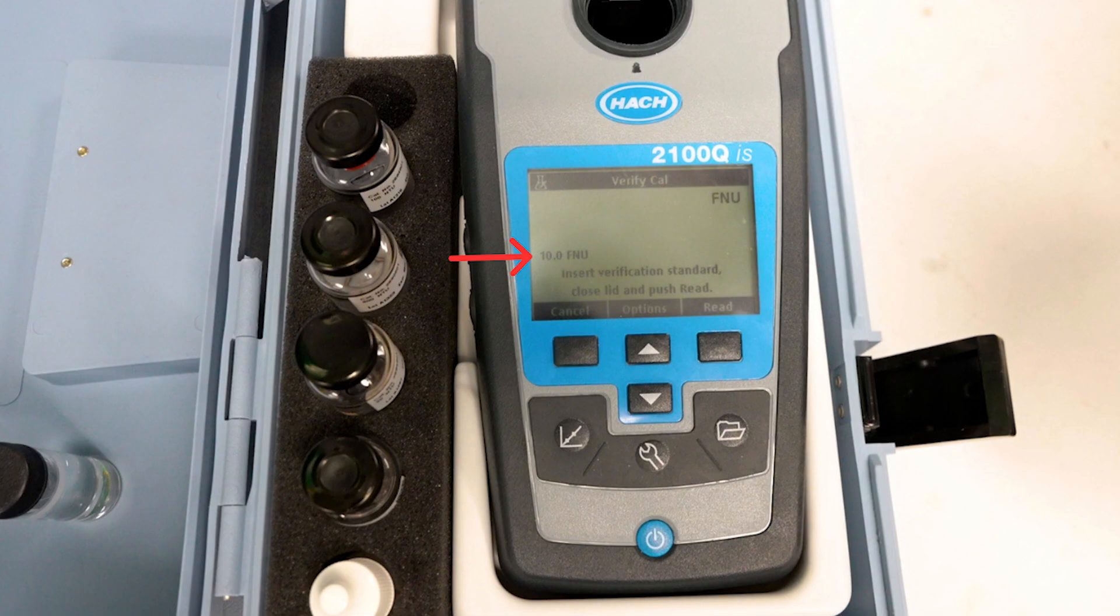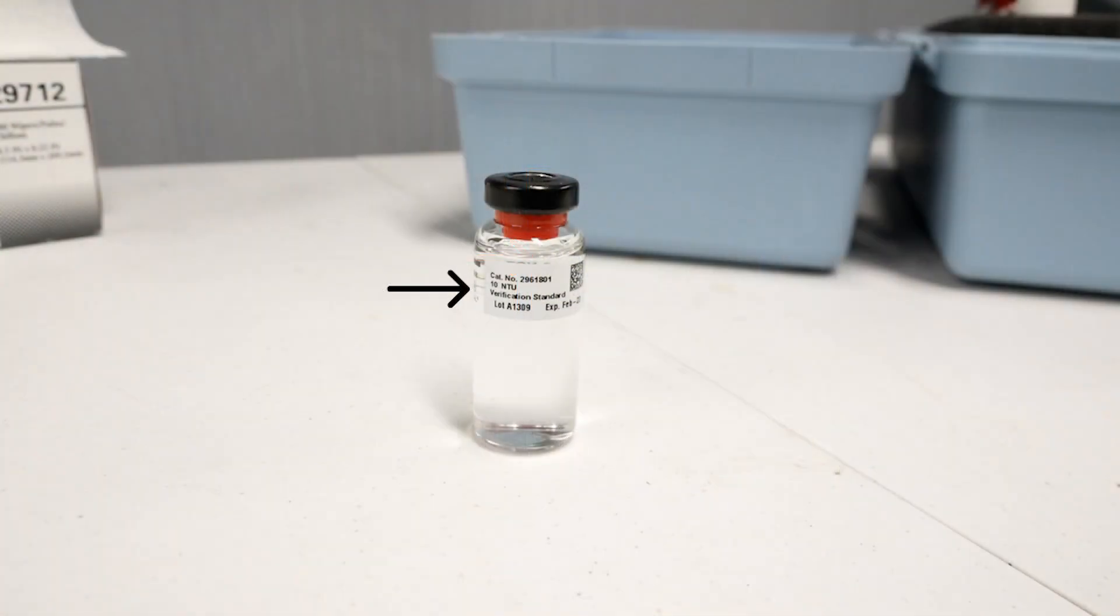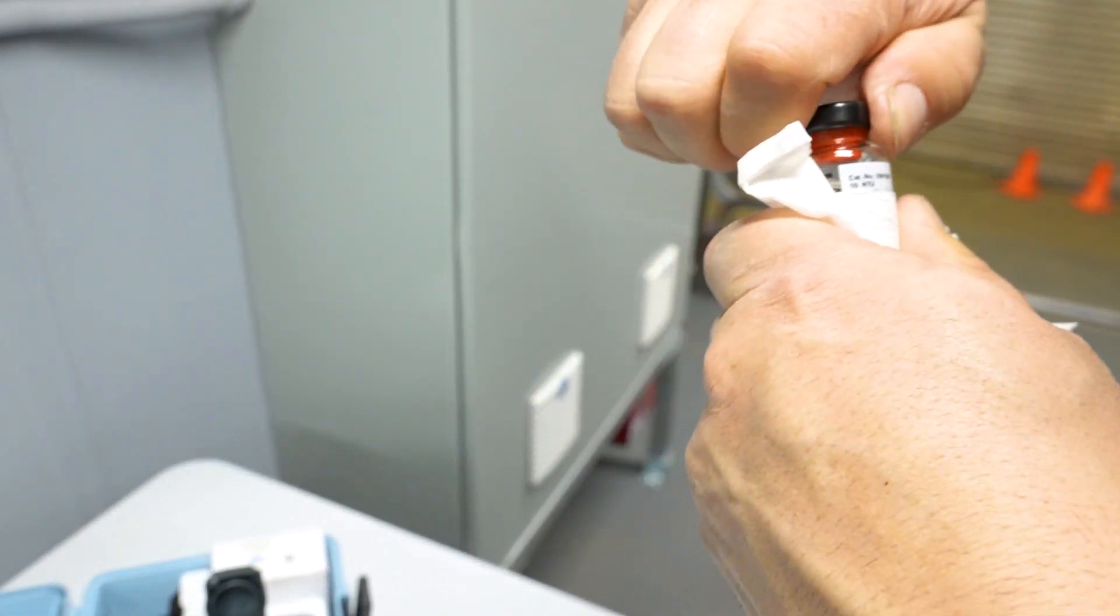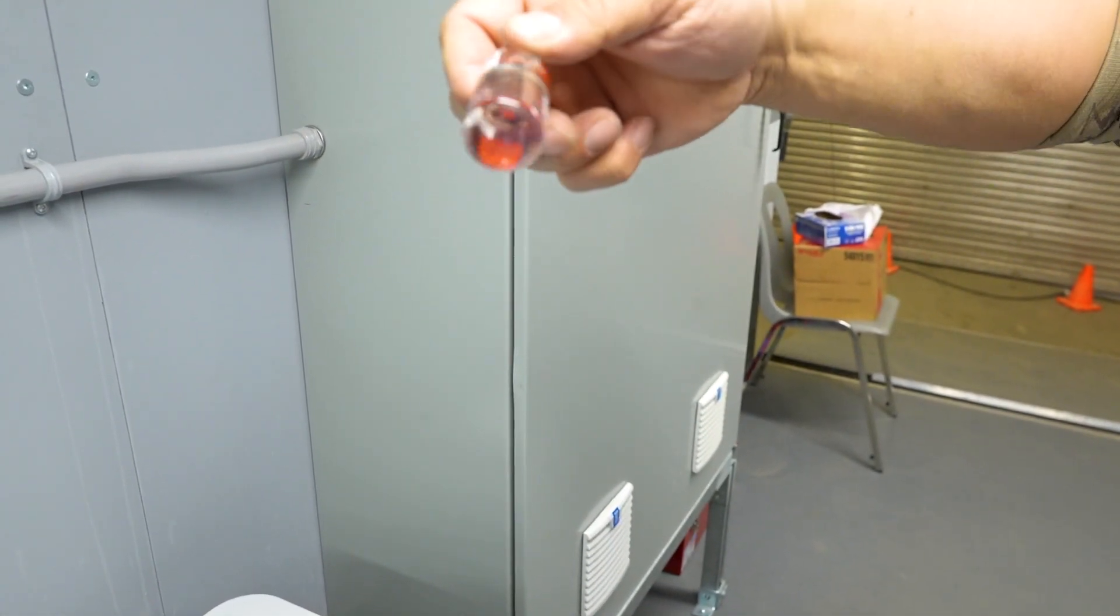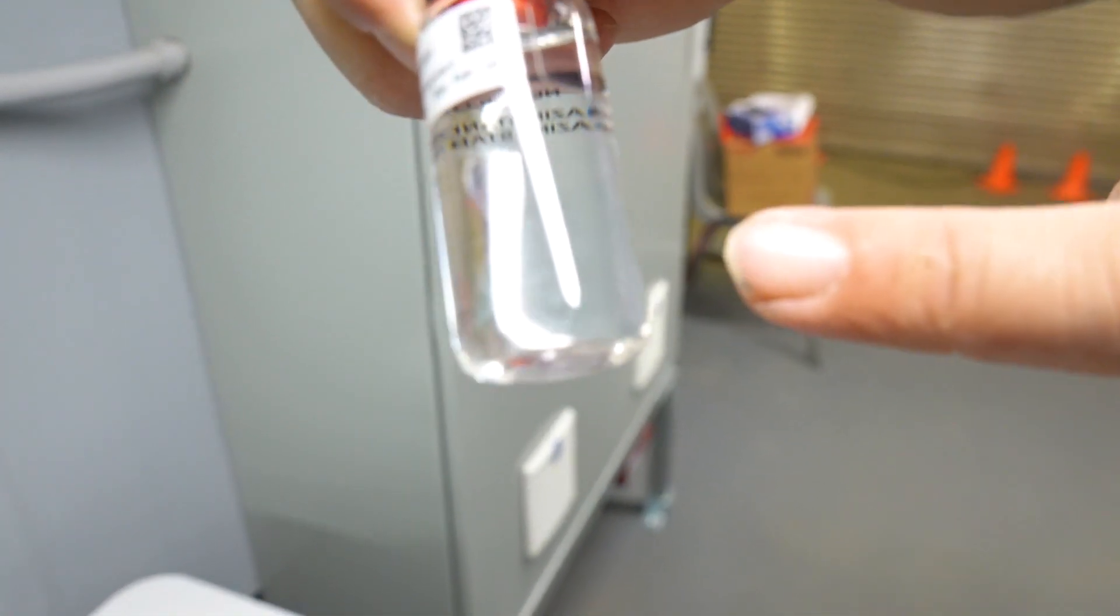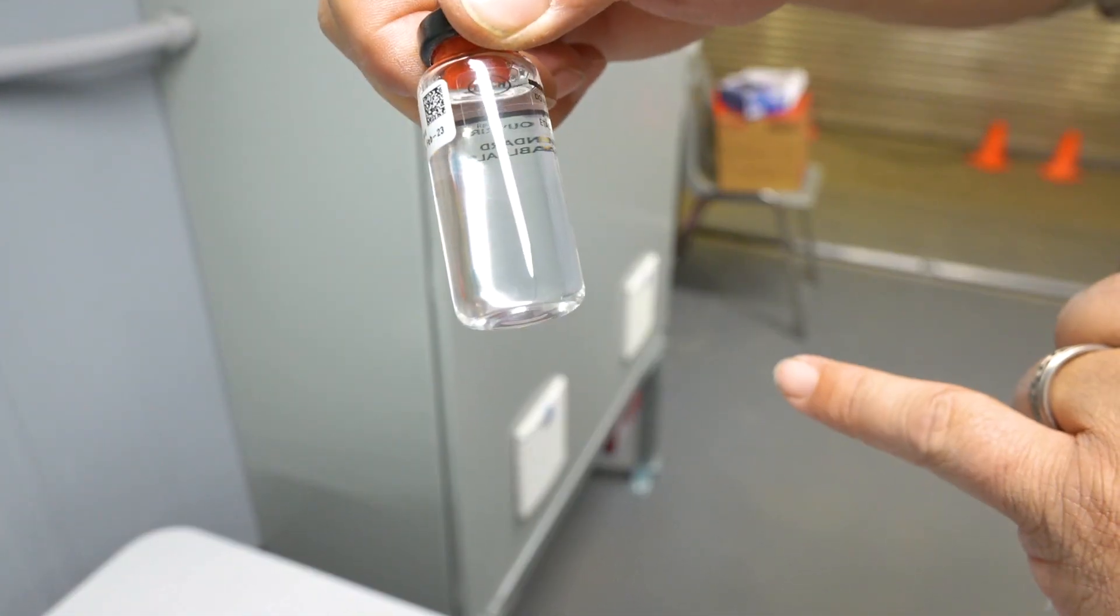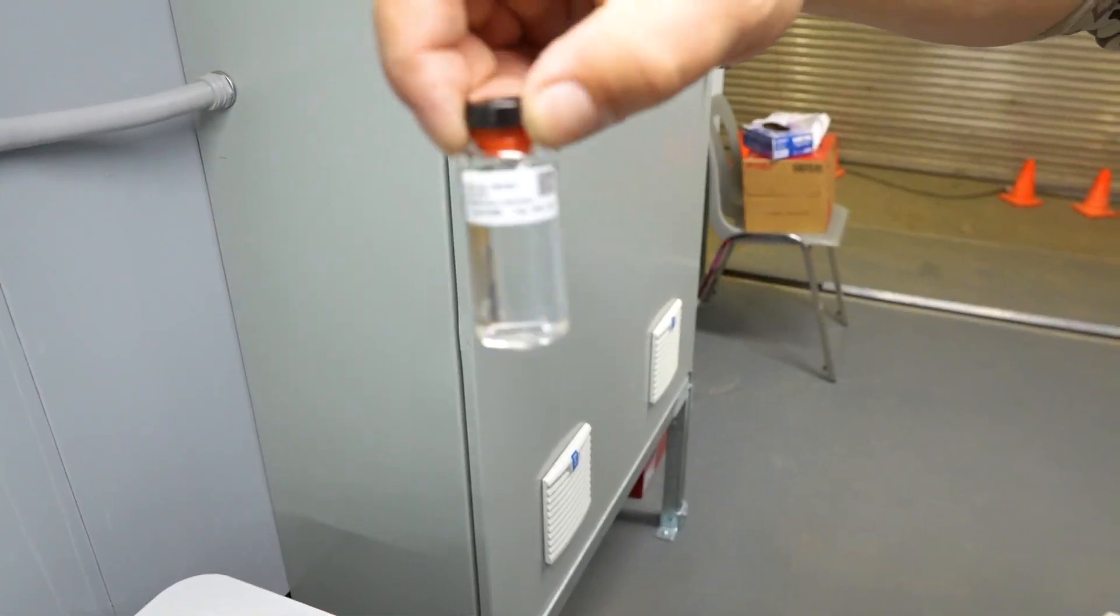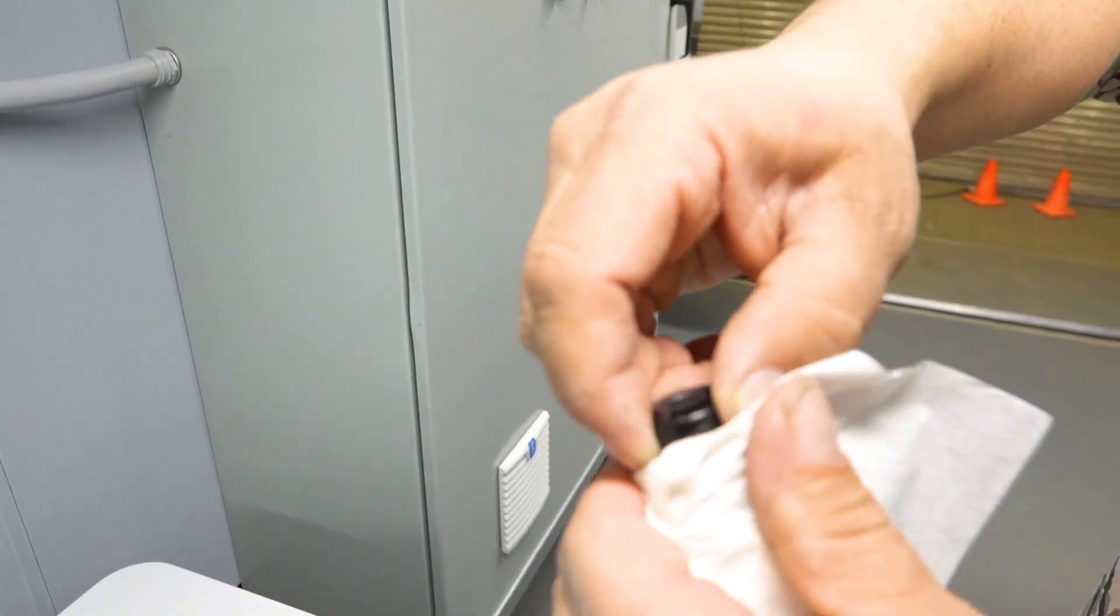So here we start with our 10 NTU, and each bottle will be labeled 10, and the same thing we've got to make sure this is clean, so we wipe it off, especially for reading turbidity because a fingerprint can give you a higher reading than what you actually have. Once it's clear we also give it a swirl because each of these units, if you see the white powder in there, is suspended, and you've got to swirl them around to make sure it's mixed up properly. You don't want to shake it because you'll introduce bubbles into the solution, and we don't want that because it'll change your readings as well.